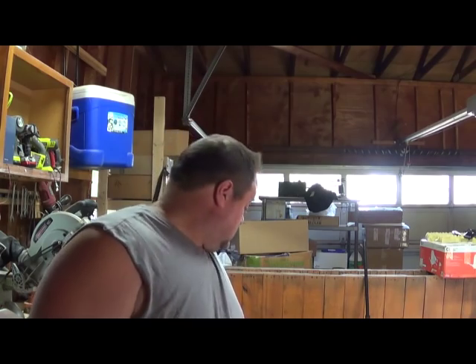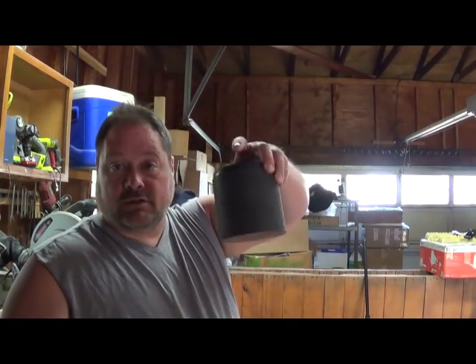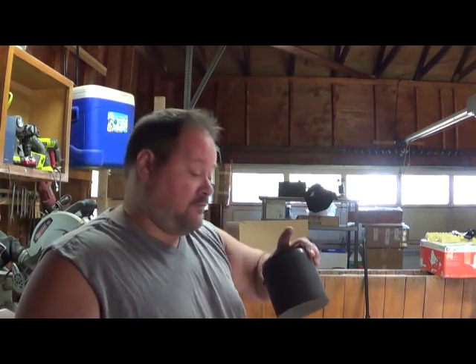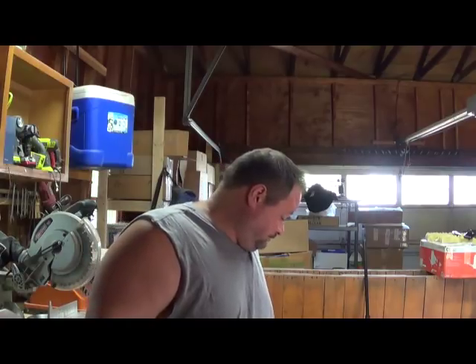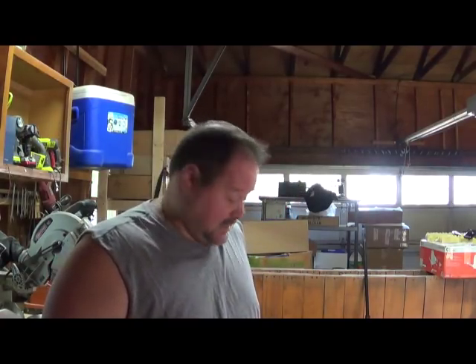I used a rock tumbler. It has these little drums here. I split it up into half. I used some ball bearings in there to help crush it up. You don't need to do that — if you did a really good job incinerating them, they should come apart fairly easily anyway. But regardless of how you break them apart, this next step is the same.